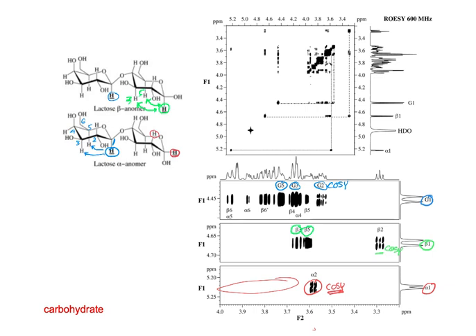I'm not sure, because G1 is showing so much other stuff here, if it's actually able to show, for example, beta 6. I don't know if it can go, because that would be from here to this position. It may be close enough, if that thing is rotating, possibly.